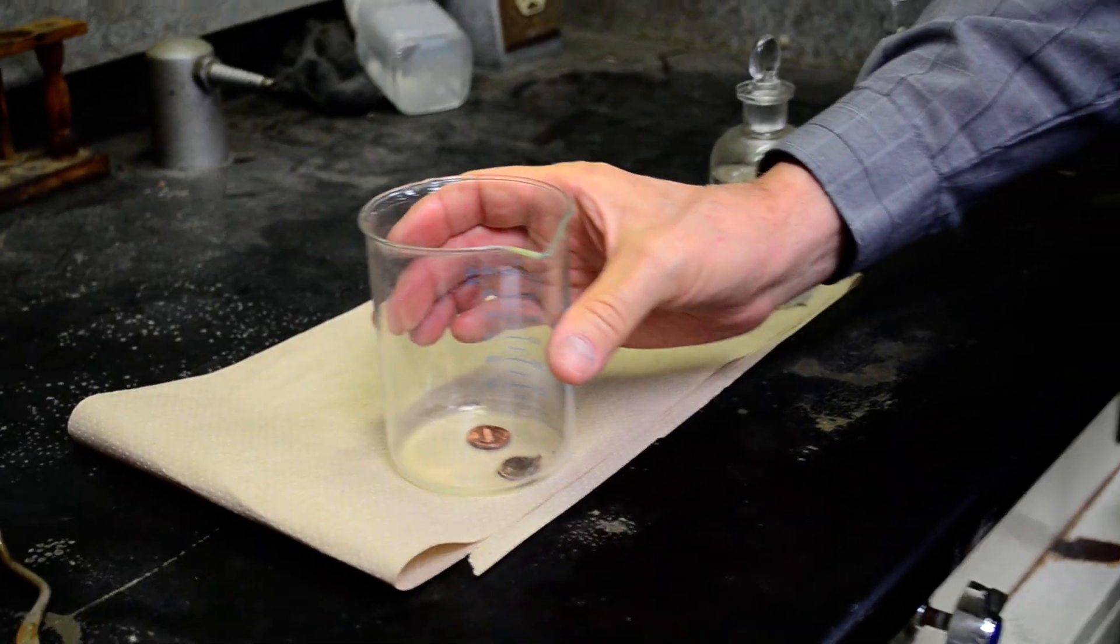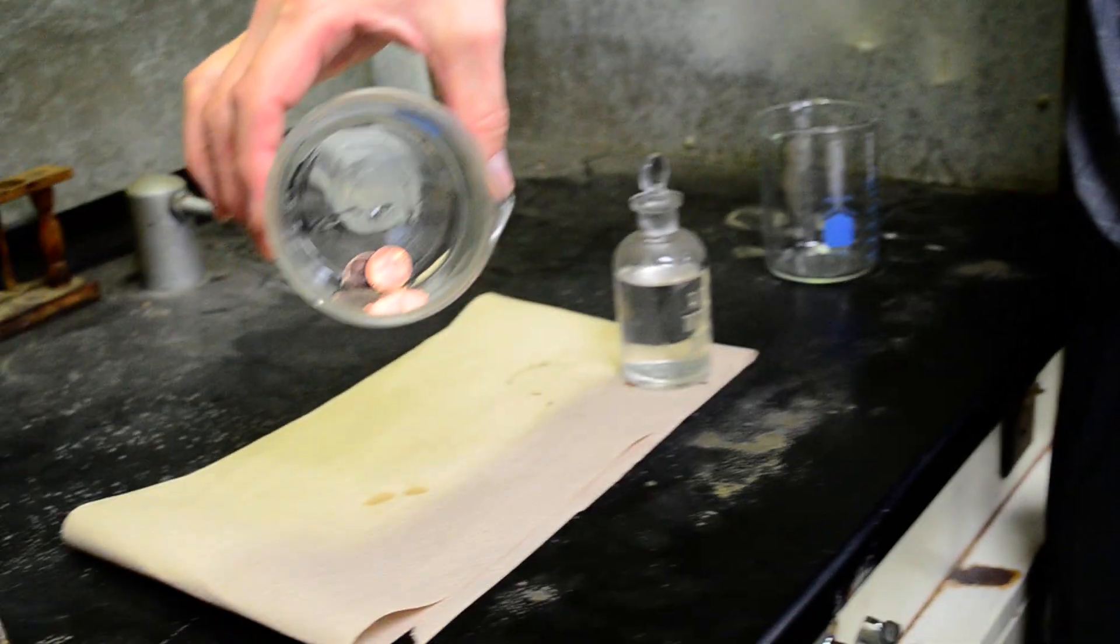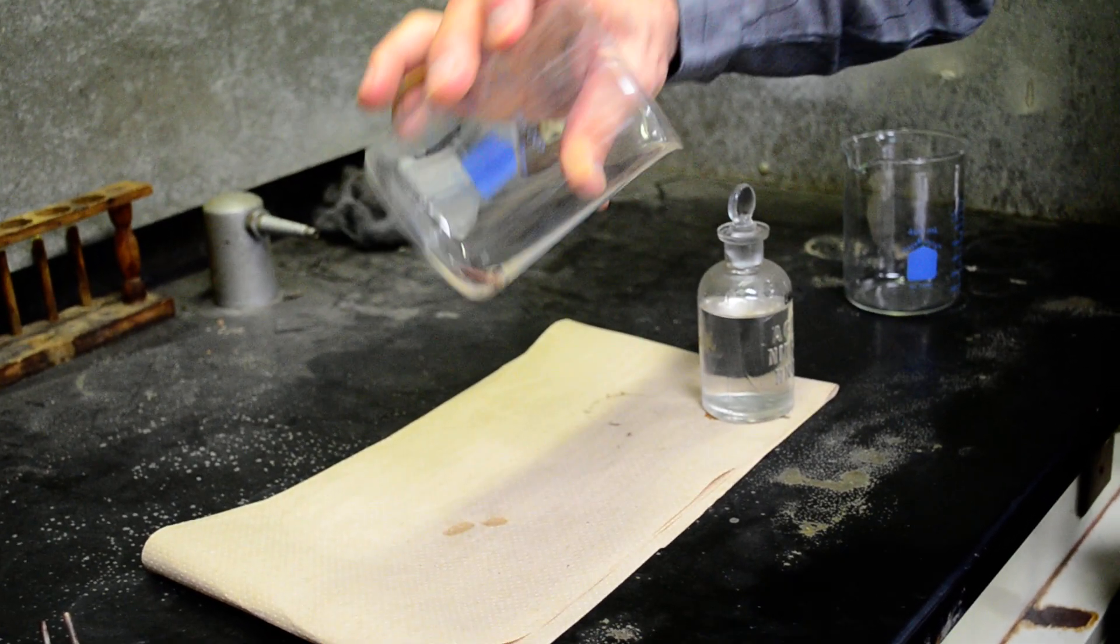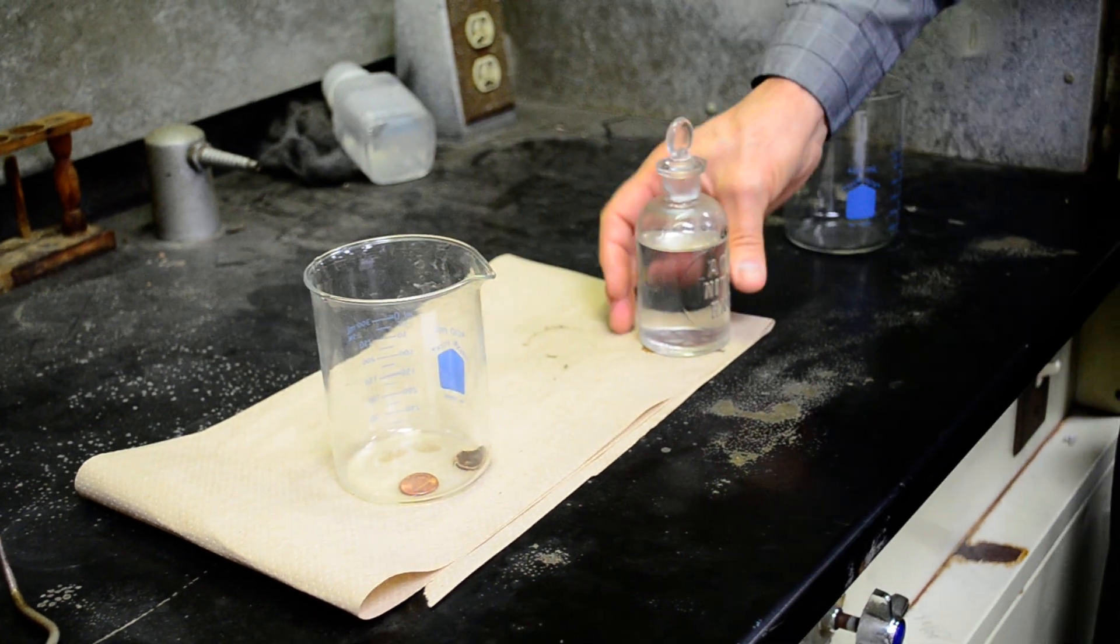What we're doing is we're going to take two pennies. One is pretty shiny and the other one is pretty corroded. I'm going to separate them here, and then I'm going to pour in some nitric acid.